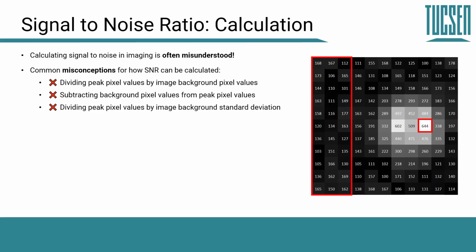We need to access those noise characteristics from completely independent measurements, or more likely from the specification sheet of the camera, or camera manufacturers might include some kind of calibration sheet or certificate of performance with scientific cameras where engineers have independently measured the noise characteristics of cameras, and they might include that sheet with the camera. That will be the most accurate way to judge the noise of a camera.